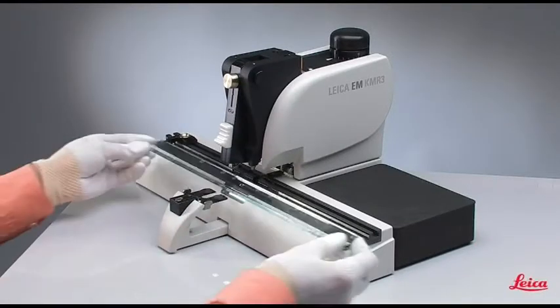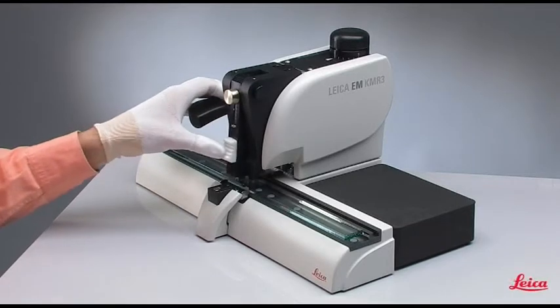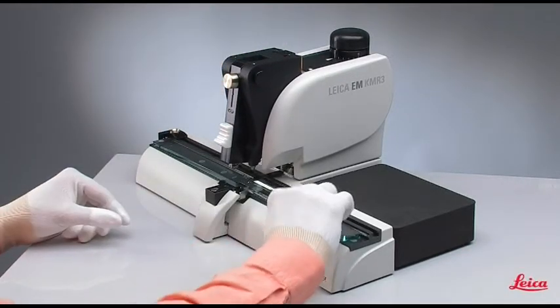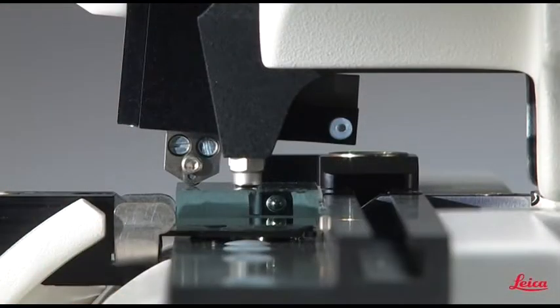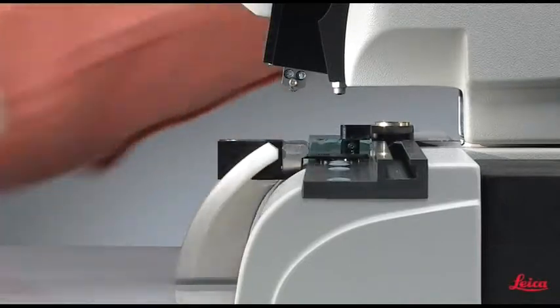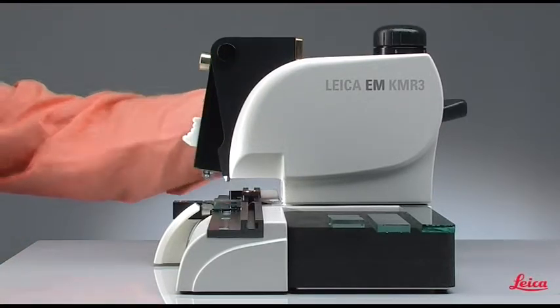Central to the new design of the KMR3 is the precise balancing of the instrument's mechanical components to produce a perfectly balanced break. The simultaneous movement of two braking pins applies exactly the same force to both sides of the glass strip. In addition, high-precision steel hemispheres provide minimum glass surface contact for the best balanced break conditions, producing an unsurpassed knife edge quality.